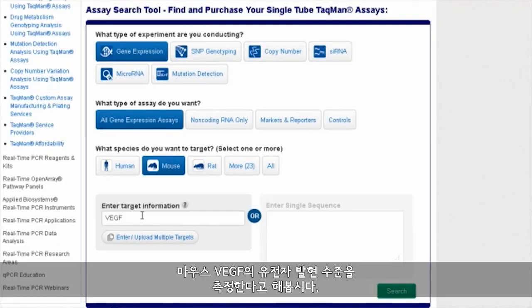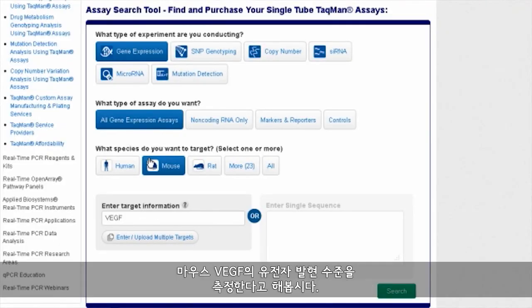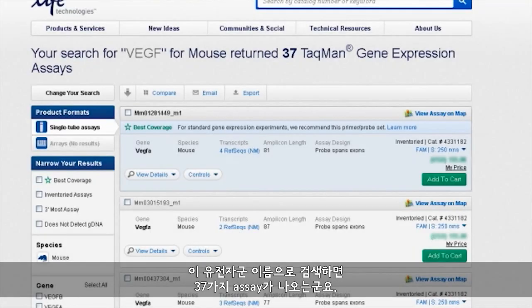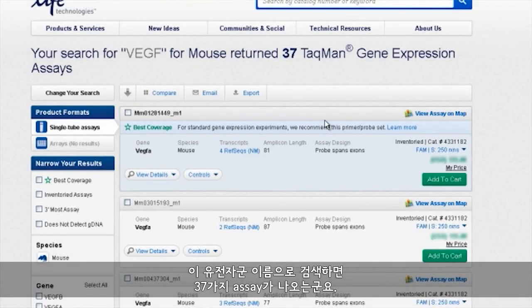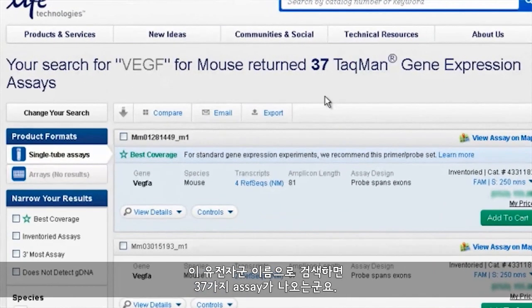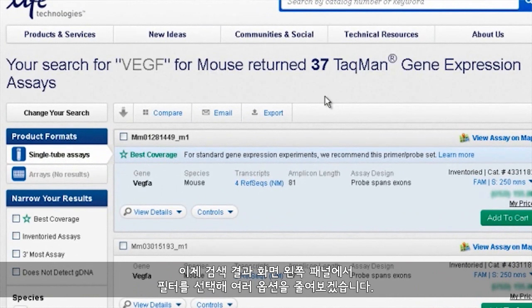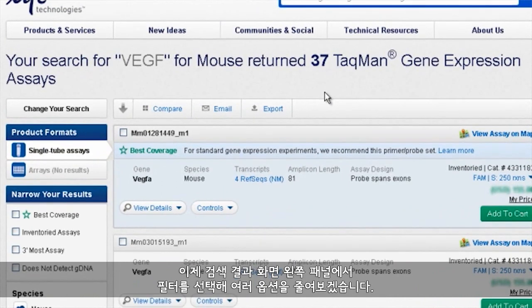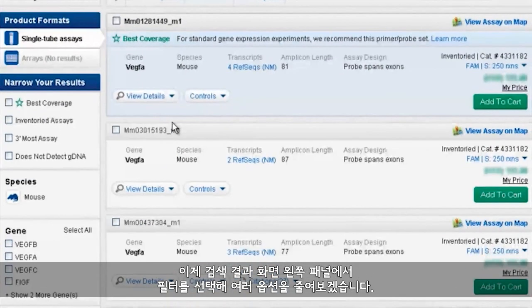Let's say we want to measure gene expression levels of VEGF in mice. Performing a search for this gene family name returns 37 different assays. We can narrow down that number of options by selecting filters on the left-hand panel of the search results screen.